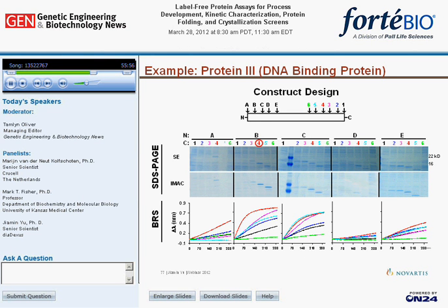When the crude soluble lysates of all 30 constructs were screened by the binding rate screen, which took only 20 minutes, that is 5 minutes per column, which holds 8 samples, the ranking of the constructs became very clear. B4 was the best by having the fastest binding rate. In fact, it was B4 that gave crystals, and its structure was solved. Next slide.